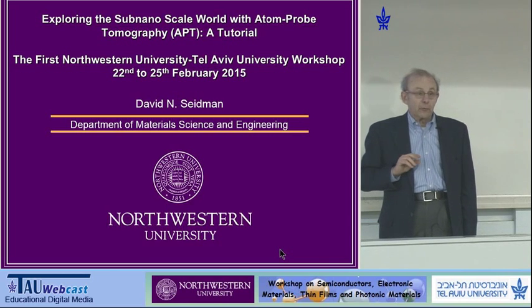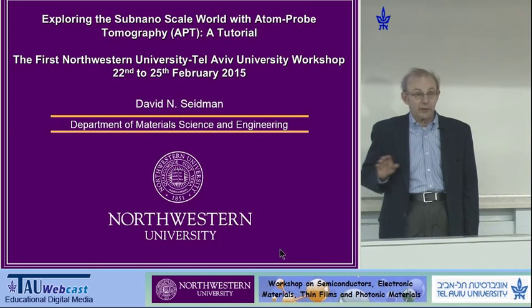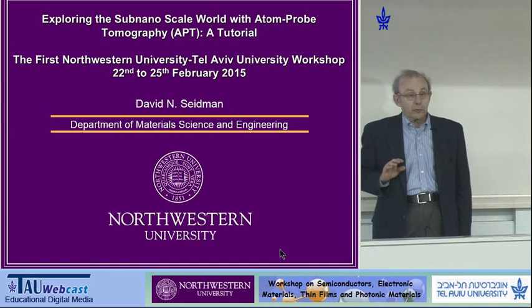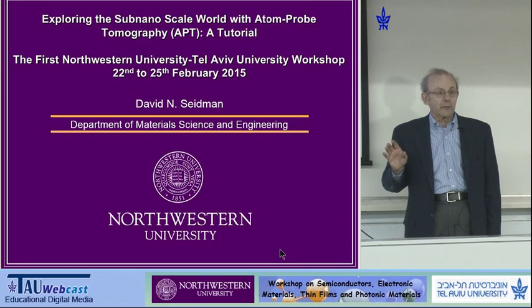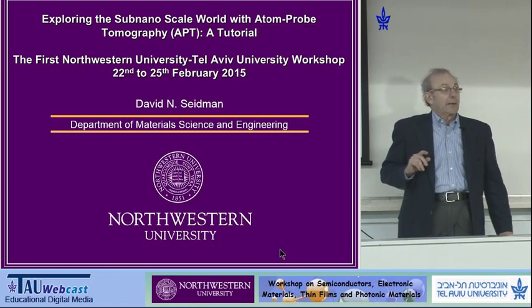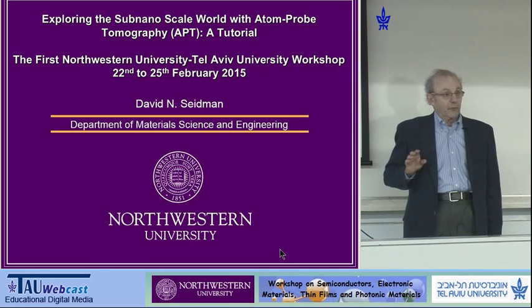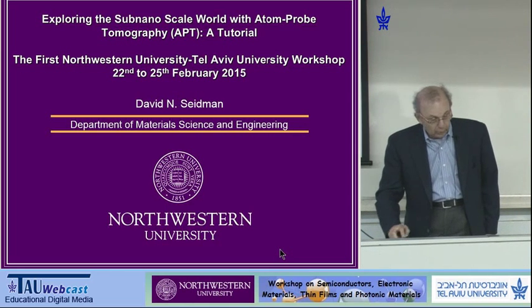The first thing I want to talk about is nano diamonds. We've been looking at nano diamonds, which has turned out to be very challenging for reasons that I'll explain. And then I'll talk to you about silicon nanowires, which involves a cooperation between Yossi Rosenbachs and Roy Yerushalmi at the Hebrew University, and also some work with a fellow in Montreal who I've been interacting with for a number of years.